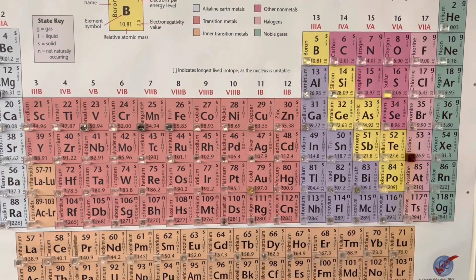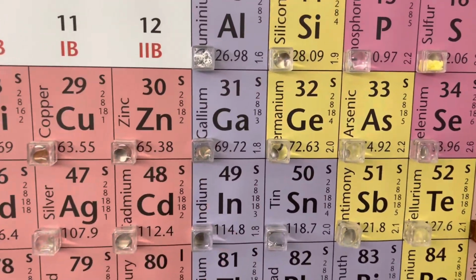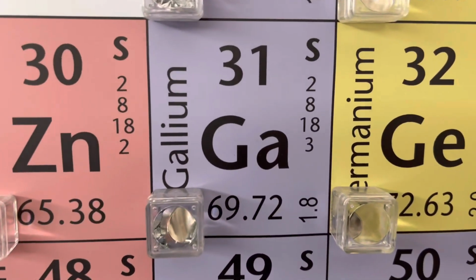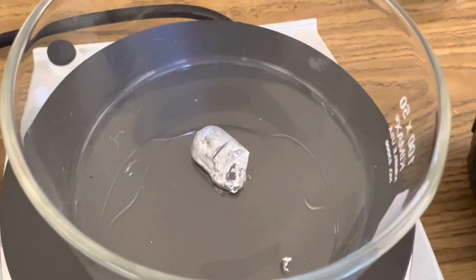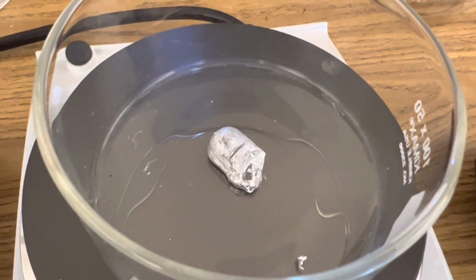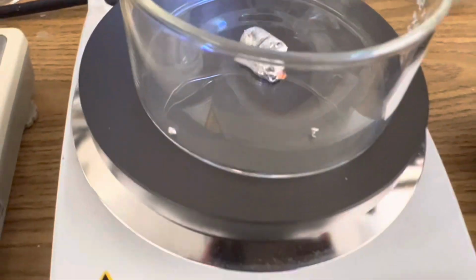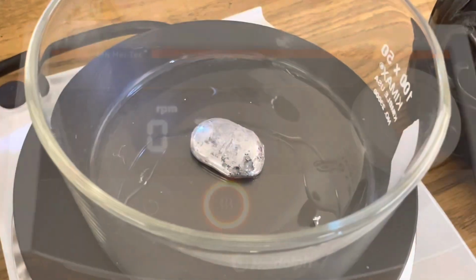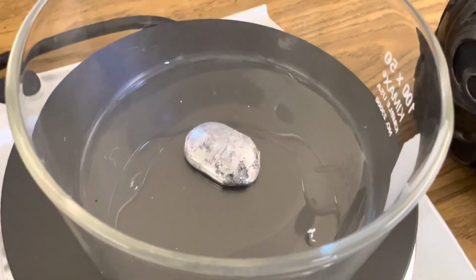Remember, gallium is a silvery soft metal. It has 31 protons. It's usually found in trace amounts in zinc ores. The first step is to add a small amount of gallium to a dish on my hot plate. It has a melting point of 29.7 degrees Celsius. At this point, you can see the gallium is almost completely melted.